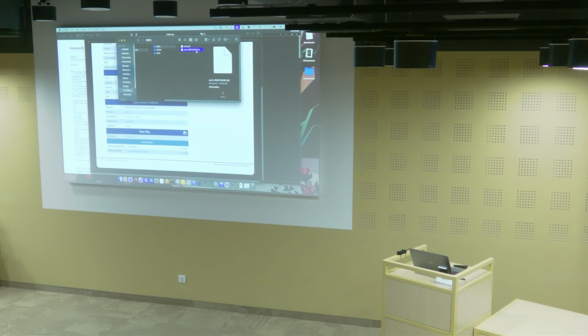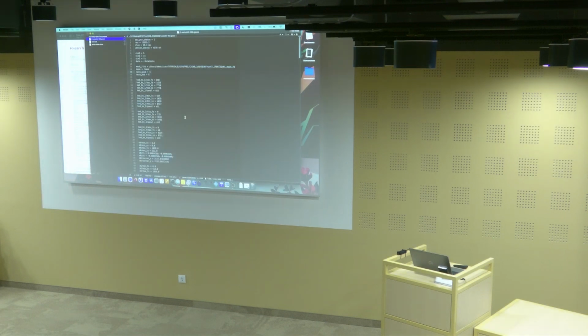And then in addition, we need to have the geometry description. Also that, in the crystallography tutorial, they tell you where you can find it. So the geometry description looks a bit like this. You have first some general information about how to read out the data, the resolution, depending on the pixel size.